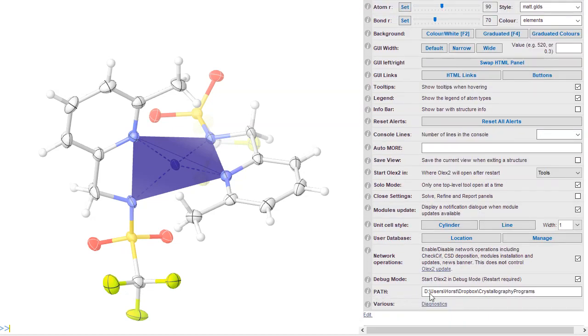There is a path field and here you must put the folder in which your crystallographic software lives. I have my crystallographic programs on the Dropbox folder so I can use it from different computers and I always know I have the same version.